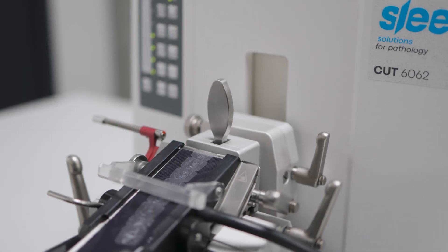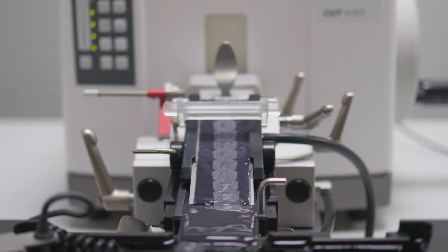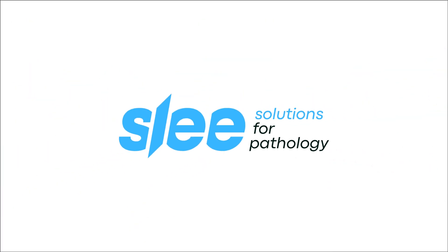As a special feature, extend the Microtome with the Aquatex system to cope with demanding paraffin sections. Enjoy working! SLEE Solutions for Pathology.